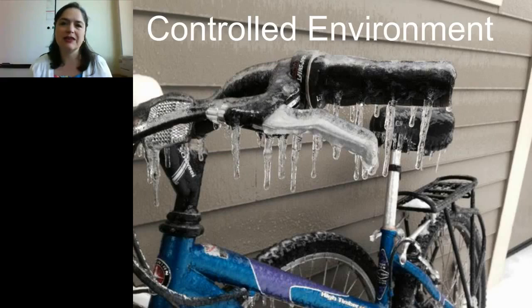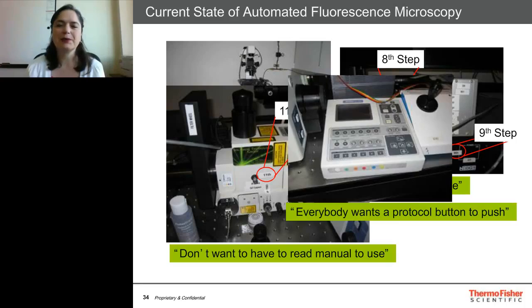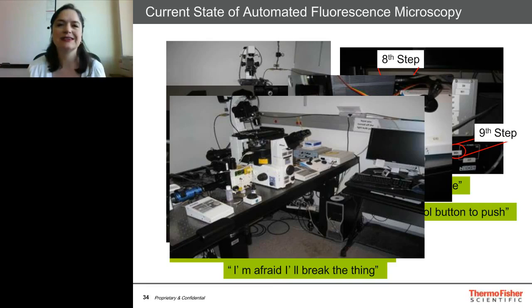And we can imagine how that would go. So one of the problems, this slide always kind of makes me a little sad as an electrophysiologist who did 2-photon imaging, but it's true. There are usually a lot of steps involved in doing high-resolution live cell imaging. I think this is 11 or 12 steps, and people can get pretty intimidated using it and trying to keep your cells healthy and do all of the things you need to do to use this instrument.